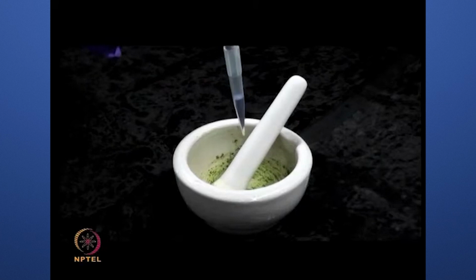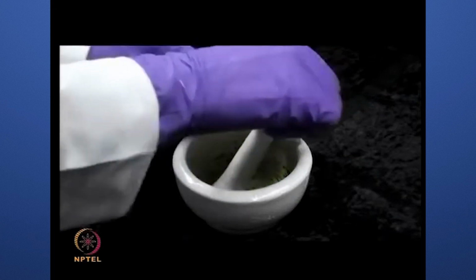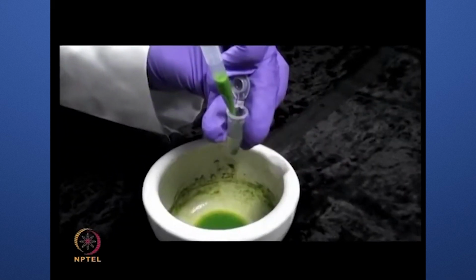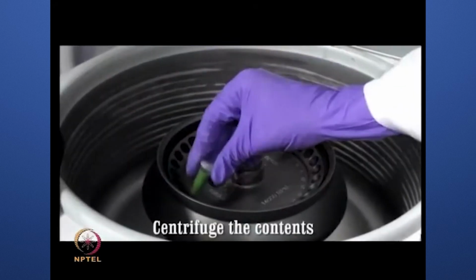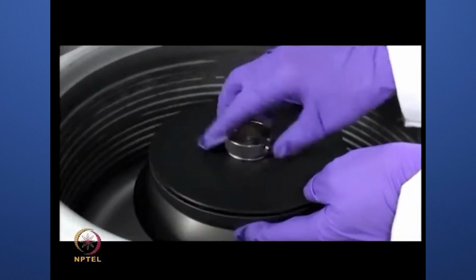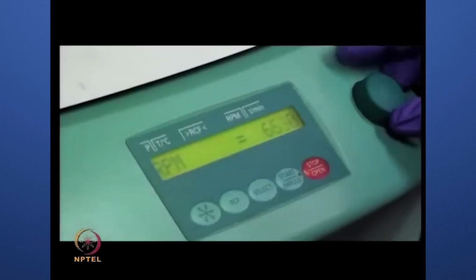Add another 1 ml of lysis buffer to the paste and then transfer the solution into a fresh tube after grinding thoroughly to obtain a uniform mixture. Centrifuge the sample at 10,000 rpm for 5 minutes and maintain a temperature of 4 degrees Celsius during the process to ensure that there is no denaturation of the proteins.